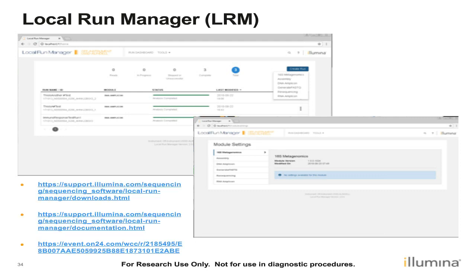And here at the bottom, I've linked you out to a couple of resources so that you can either download Local Run Manager for your off-instrument use. I've also linked you out to where you can find the documentation for it and even to the Local Run Manager webinar. So again, this tool is really nice because you can do it right on your instrument and it's free. So it's free to download, it's free to have it on the instrument. It's a great local analysis solution.